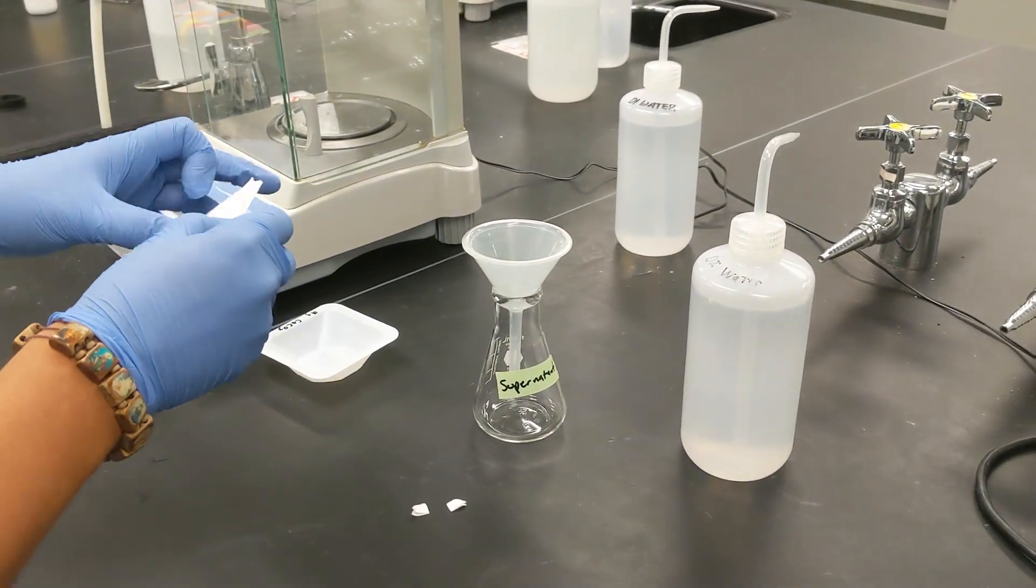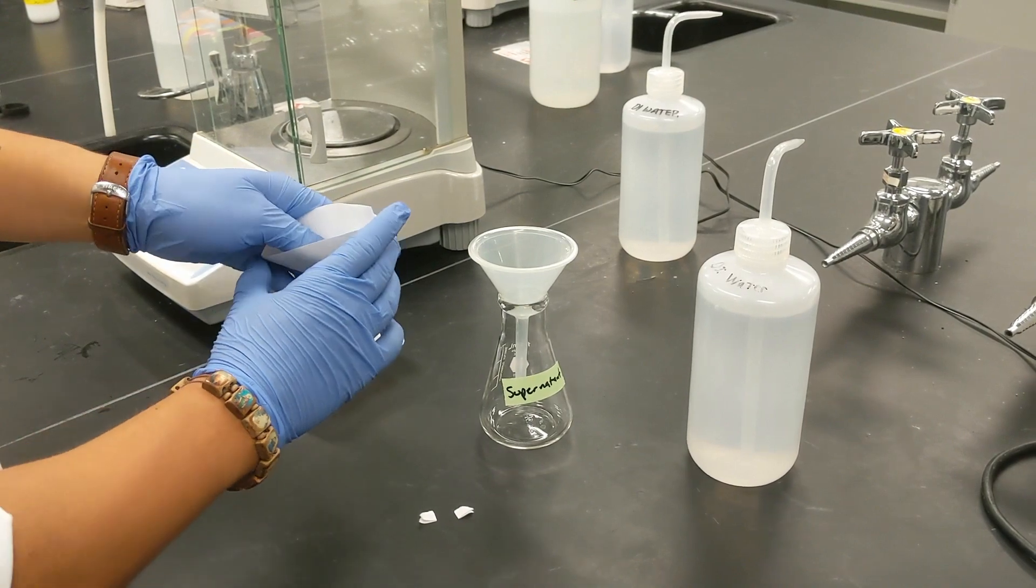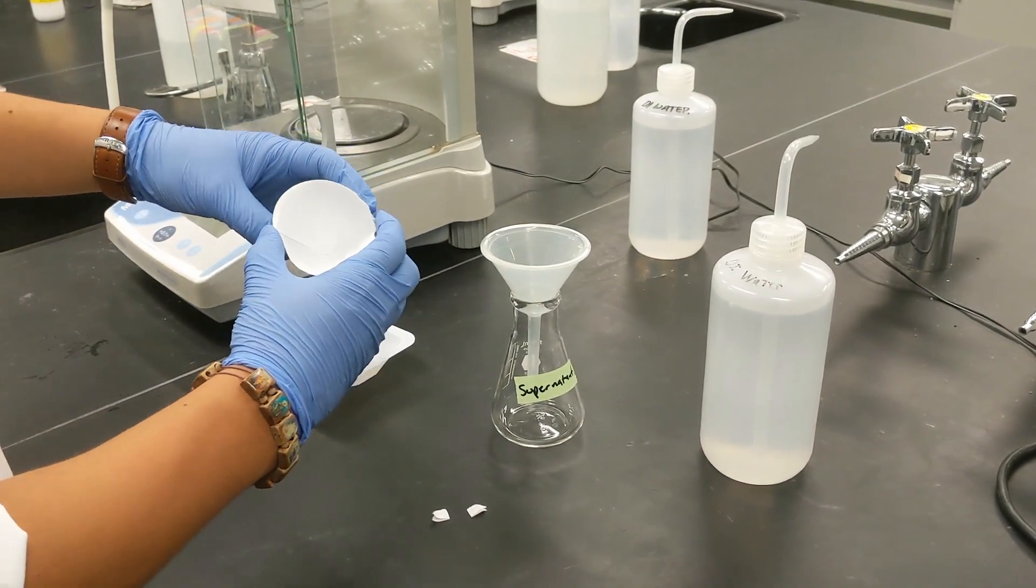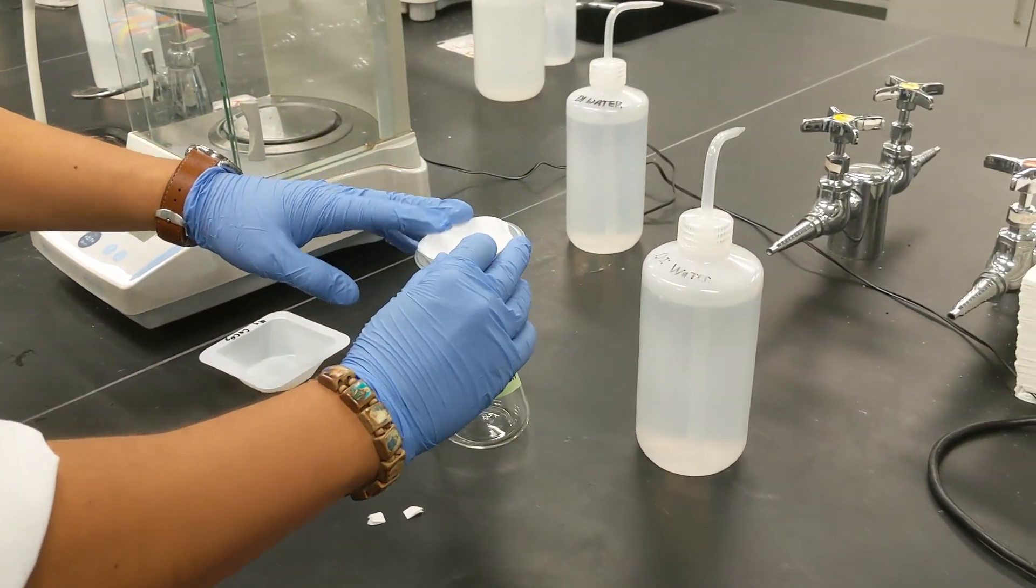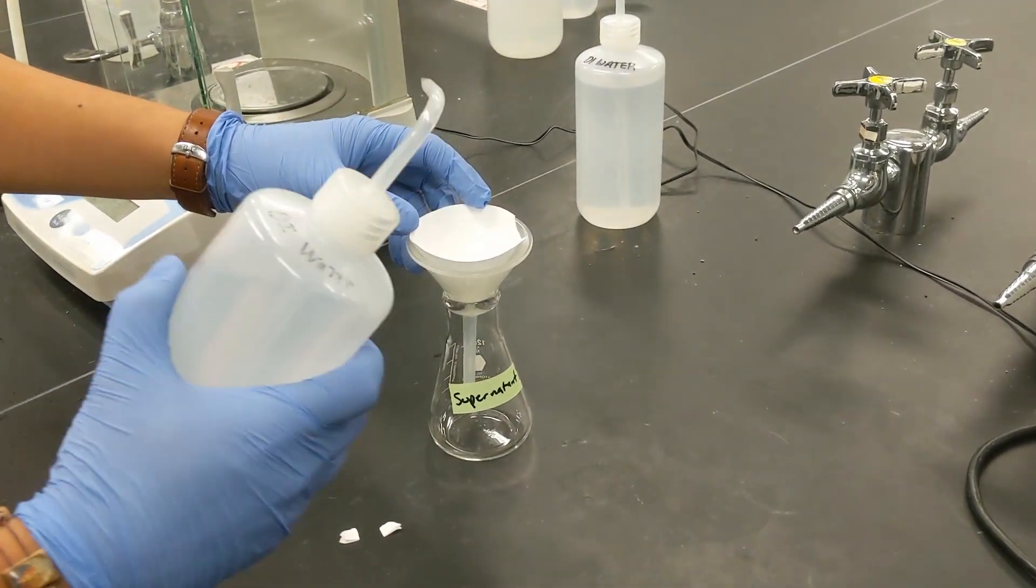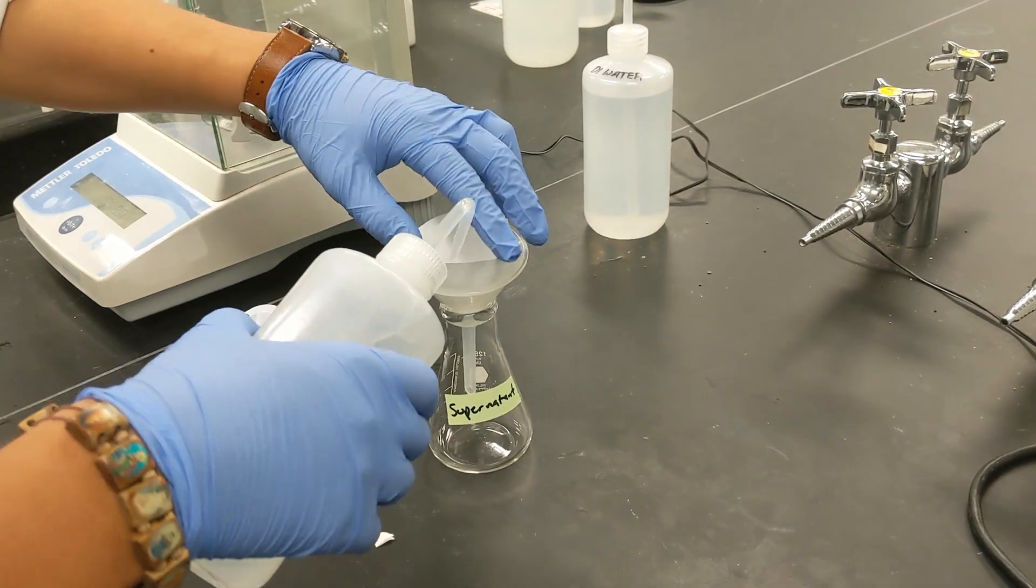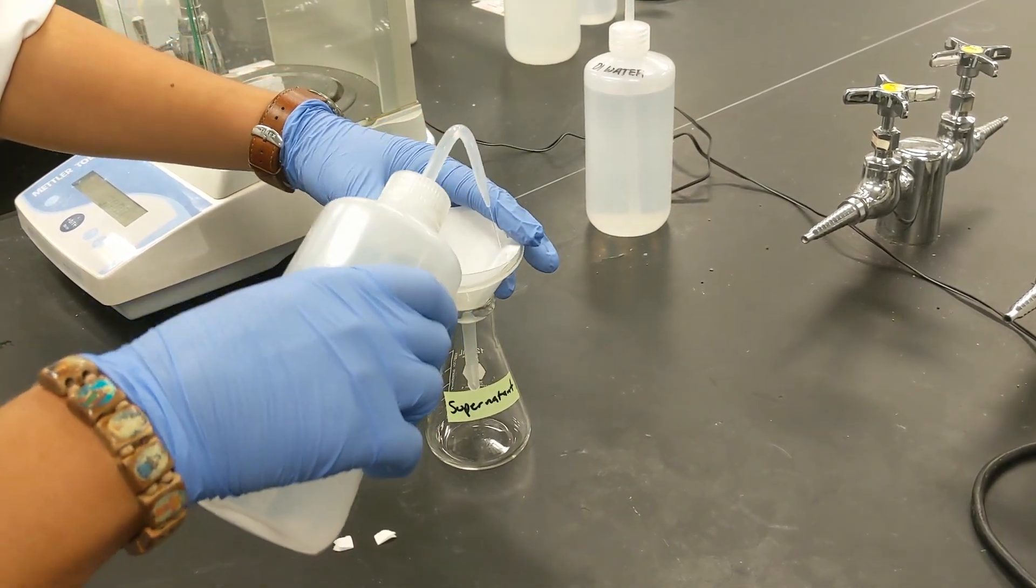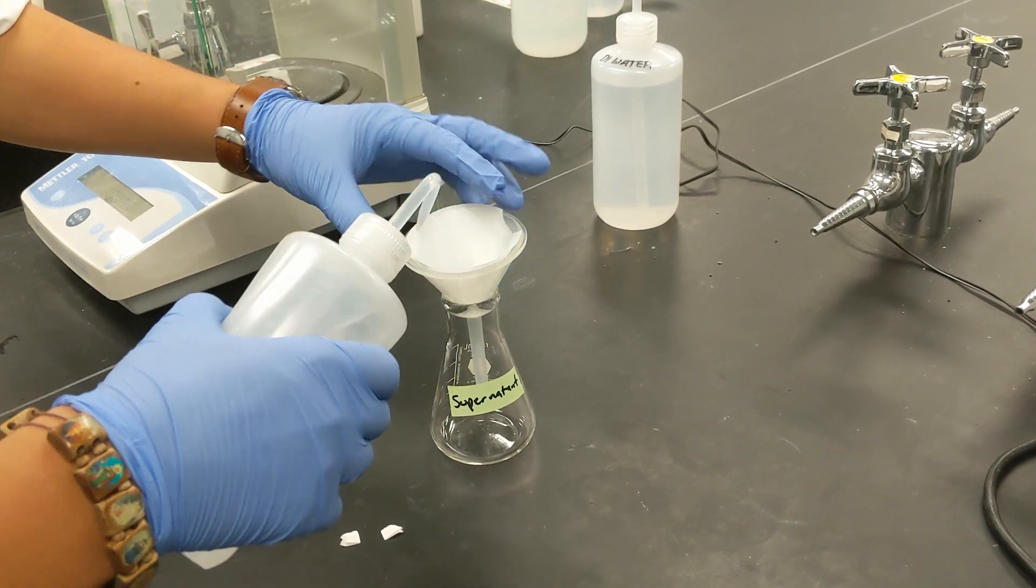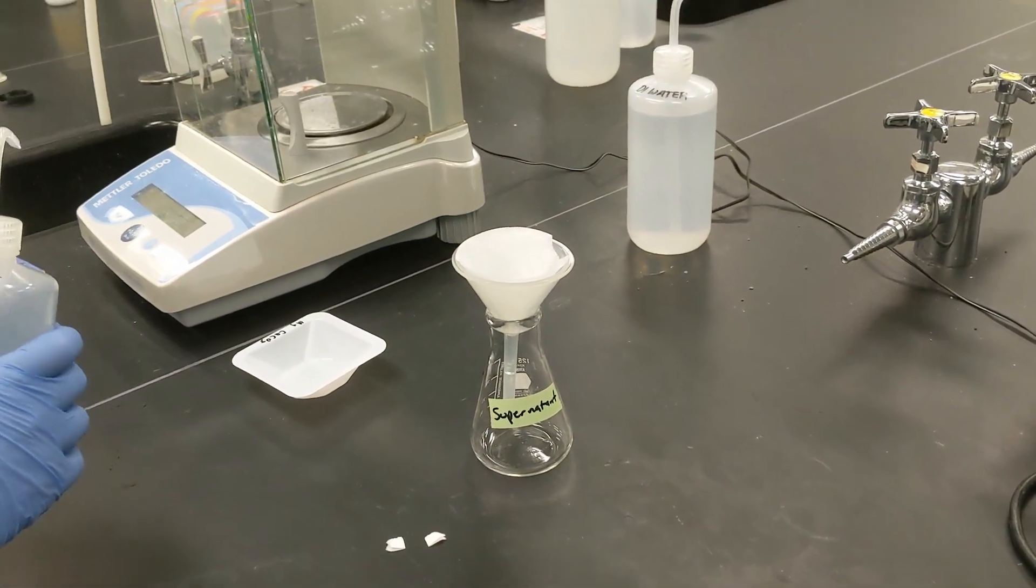And then now with our filter paper we can form a little funnel by just opening it up, placing this into the filter and then we can seal the sides of the filter paper with some DI water just to get it to stick to the side so that it stays flat. And now our filtration device is ready to go.